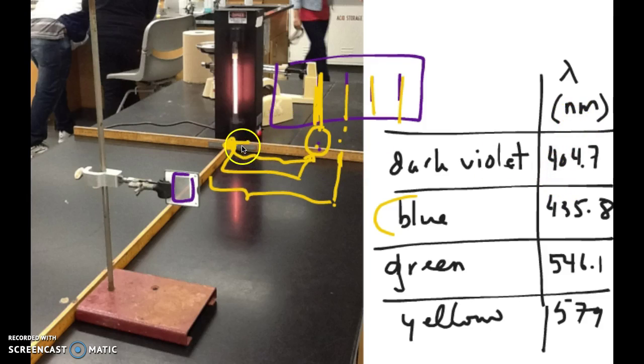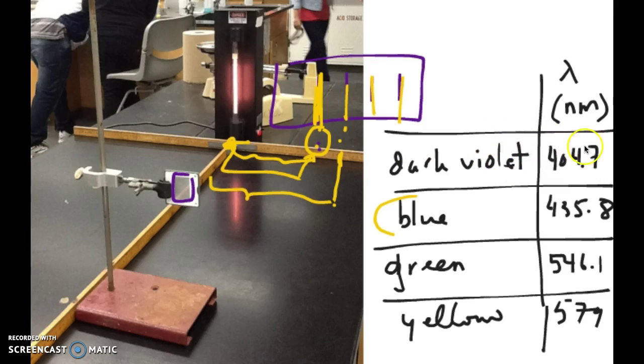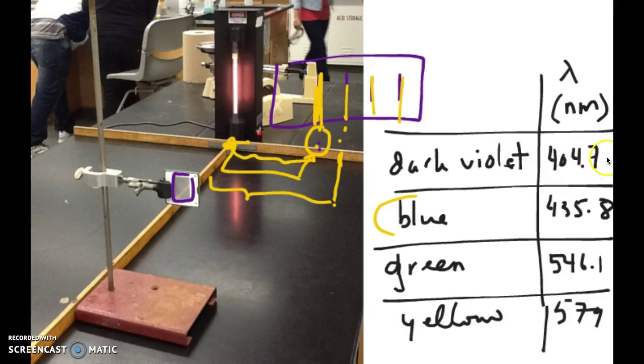So what you do then is you try to find those lines and each line already has a wavelength assigned to them. Now, what you do to calibrate is basically you measure the distance from the center of the meter stick to that line. So let's say this is your dark violet line. So you're going to measure a distance from this to here. And let's say that's 12.3 centimeters. You would write that on your table next to the wavelength. So 404.7 nanometers corresponds to 12.3 centimeters on the meter stick.